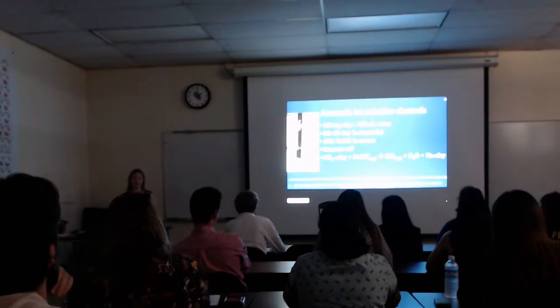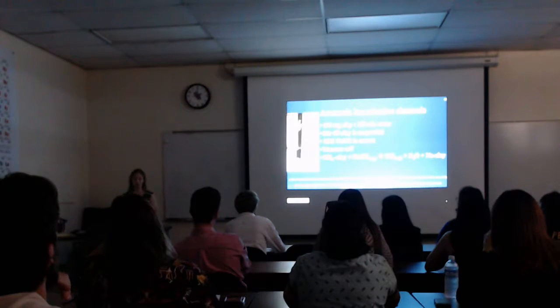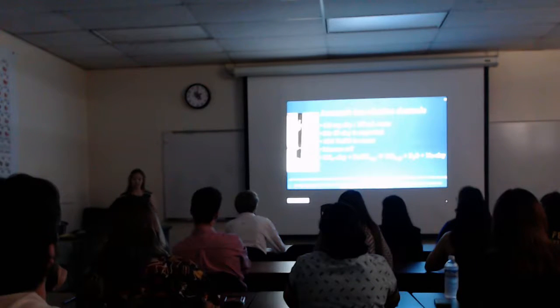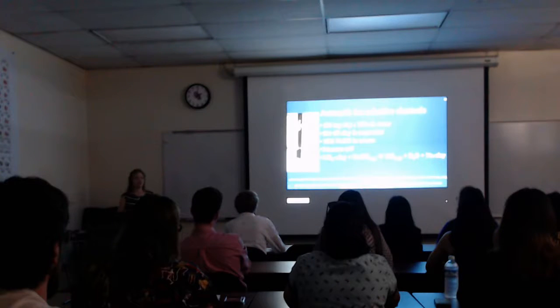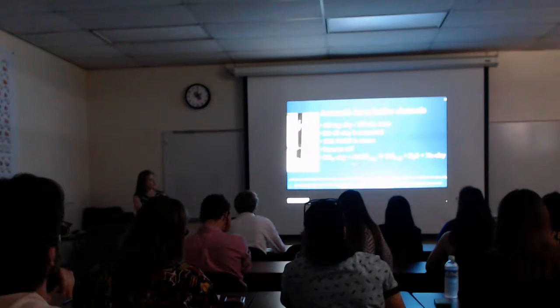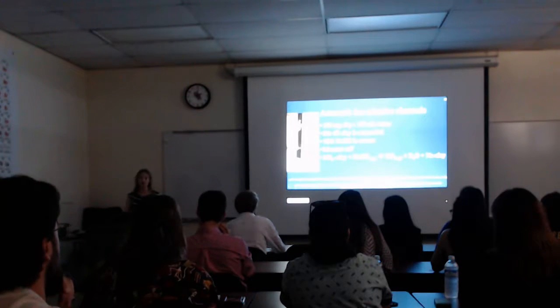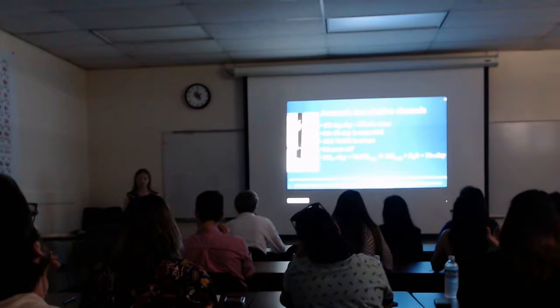We stirred the clay until it was well suspended to account for the fact that clays do swell when they touch water. And then we reacted it with sodium hydroxide in excess, a very strong type of sodium hydroxide, and measured the millivolt readout. What we were hoping would fully happen was that the ammonium clay would react with the sodium hydroxide to produce ammonia gas, water, and sodium clay. This way we could count how much of the ammonia gas was released by the millivoltmeter so that we could then determine the CEC.